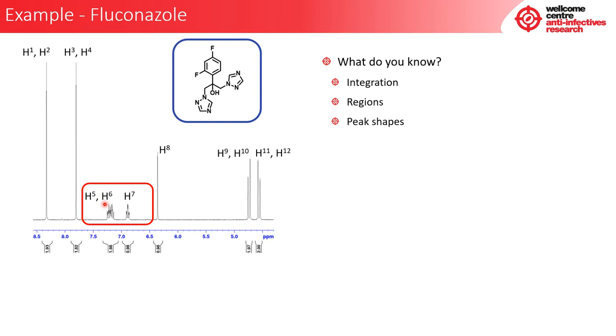We're then saying, okay, what can this tell us about it? Well, for now, we want to leave it as it is. We're just saying that there are three aromatic protons. We're not too sure how they see each other, because perhaps some of these see each other, perhaps both see each other. Right now, we don't know.